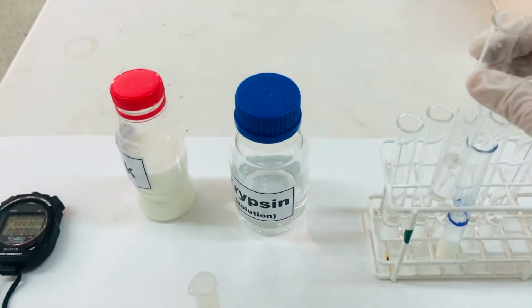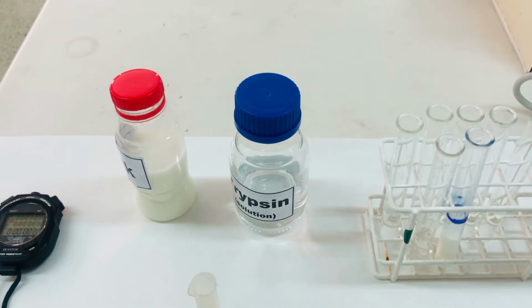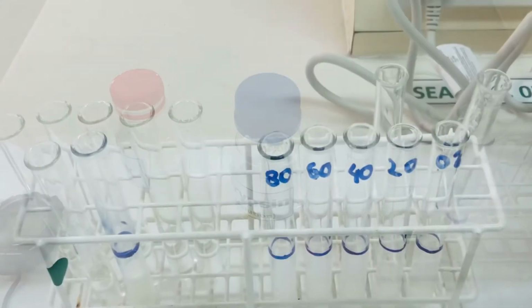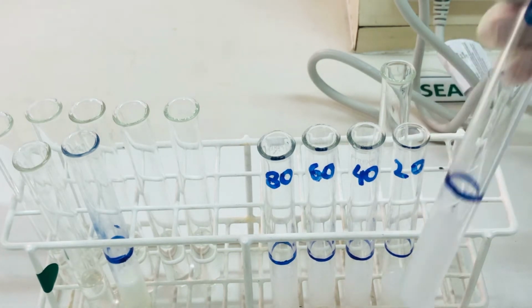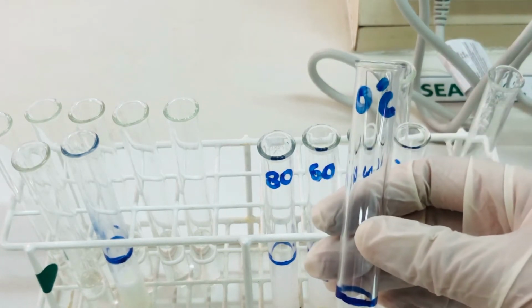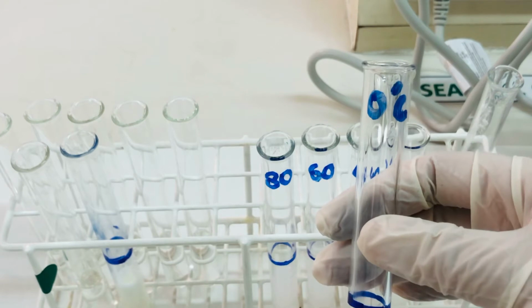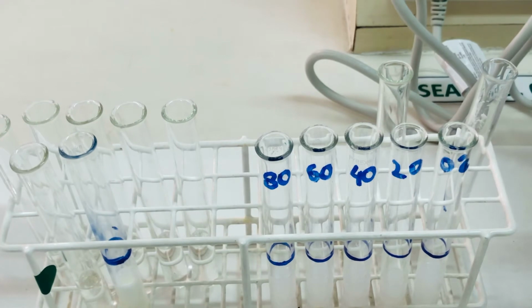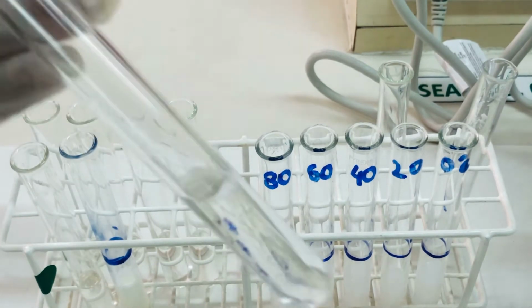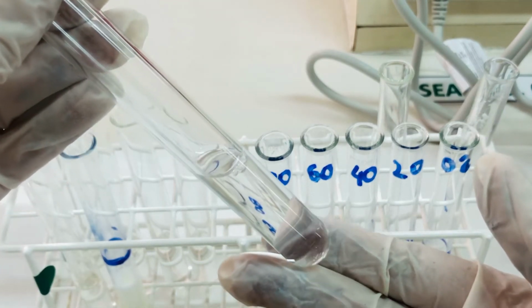Now, since we have 5 water baths, we have prepared 5 sets of milk sample and trypsin. As you can see, we have prepared 5 sets of milk samples containing 5 ml of milk in the test tube and marked these test tubes with the temperature of the water bath. Similarly, we have taken another 5 test tubes and have put 5 ml of trypsin in these test tubes.